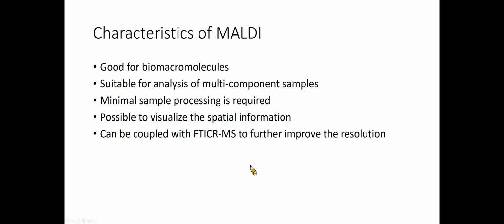Compared with other mass spectrometry ionization techniques such as electron bombardment ionization and chemical ionization, MALDI technology has the following characteristics. First, it can ionize some samples that are difficult to ionize by other ionization techniques, especially biomacromolecules, and obtain complete ionization products without obvious fragments. It has a dominant single-charge molecular ion peak and a simple mass spectrum, which is suitable for analysis of multi-component samples.